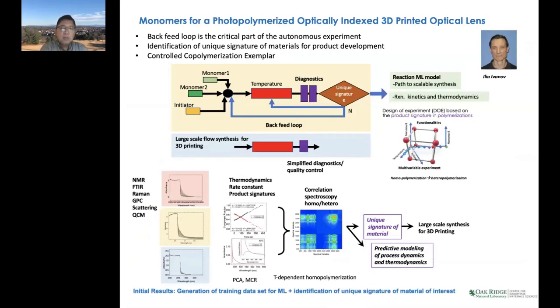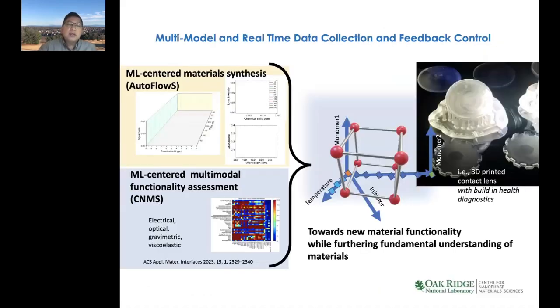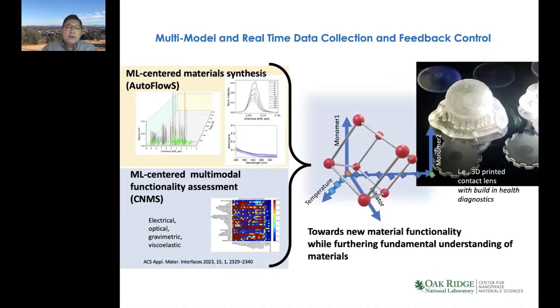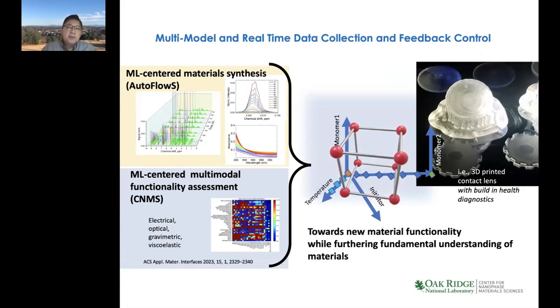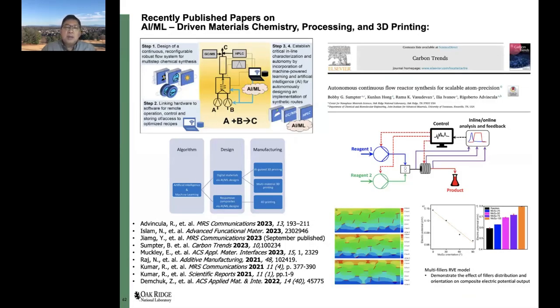So as an example, we focus on the synthesis of a copolymer that involves two monomers and an initiator, controlling the temperature, the pressure, the flow rate, and thus produce gradient polymers that can be designed initially with the workflow that takes advantage of various combinations of parameters that can give us the best conclusion. In other words, we can do this experiment by first simulating or creating a digital twin, doing the experiment on a flow chemistry setup, monitoring the reaction as a time or space series. So in this case, the NMR, the IR, or the UV-Vis spectra, and then finally running the instrument in a feedback loop operation to optimize the result.